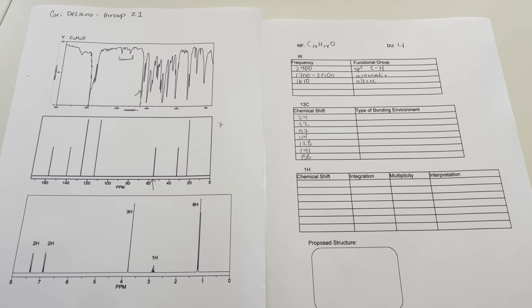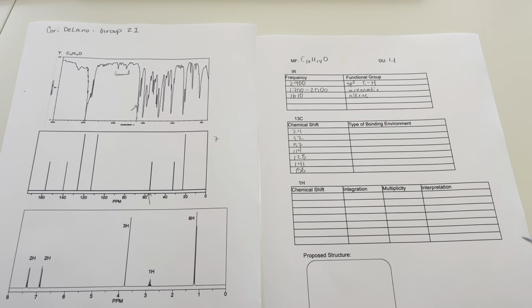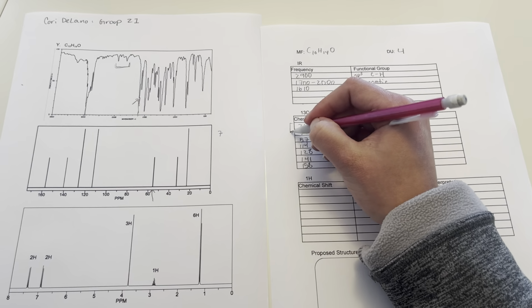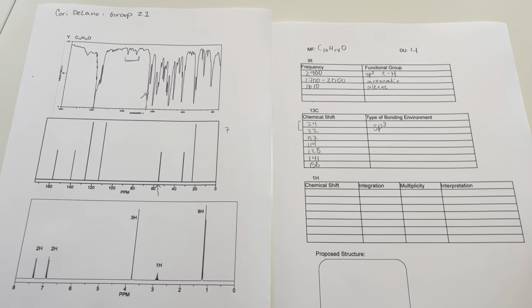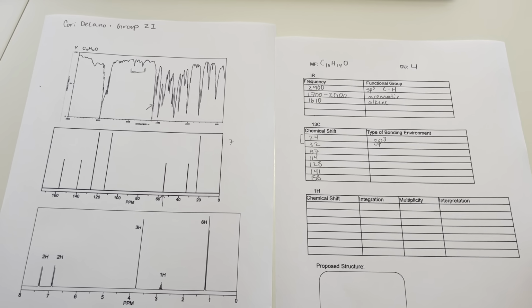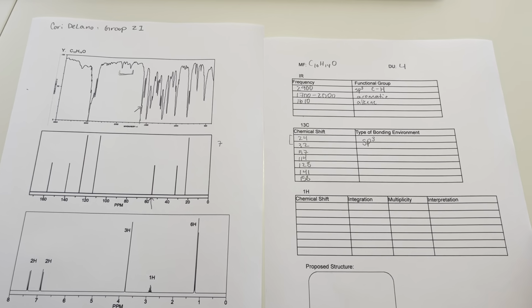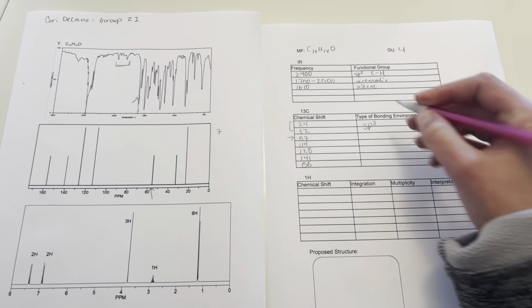Then we want to line these up with their ranges to see what type of bonding environment it's going to be. 0 to 40 is just sp3, so these first two are sp3. Then 40 to 90 is carbon to oxygen, so that's just the 57, it looks like.